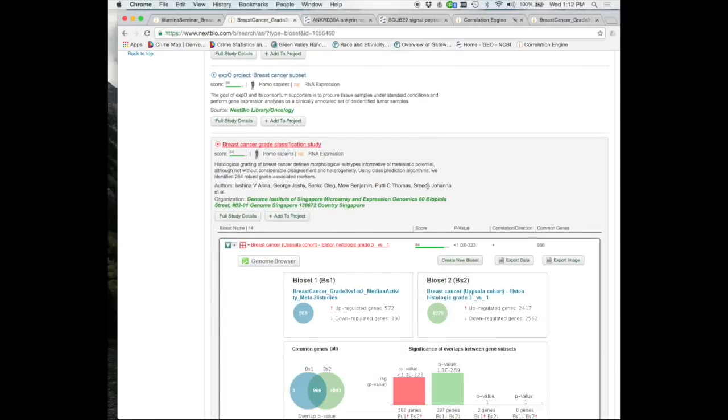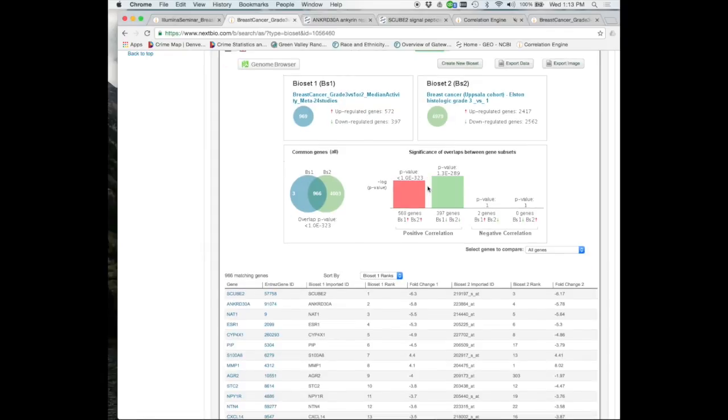Absolutely. Go back down there for a second. So you compared grade 3 to grade 1 according to the text there, right? Well, that's the list I'm comparing to. Right, but when you look at overexpressed genes, it would be overexpressed in a grade 3 cancer versus a grade 1 cancer. Is that right? I took grade 3 either versus grade 2 or grade 1. Yeah, I'm just trying to figure out what's over and what's under.